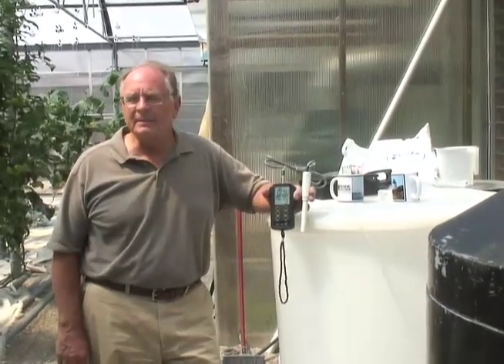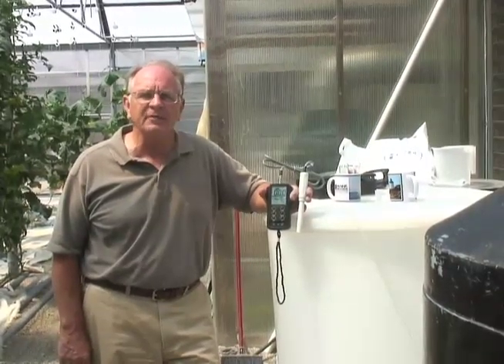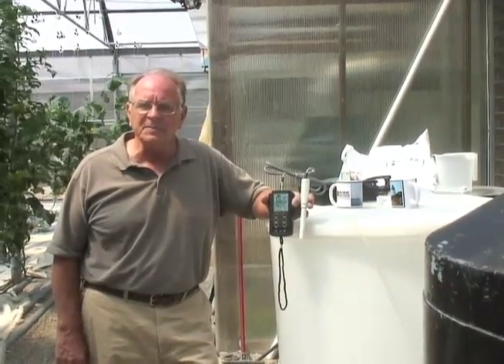The hydroponic industry relies on two main parameters: the pH for the solubility of the fertilizer, and the EC for the concentration of the fertilizer. We can measure both with this meter very easily.